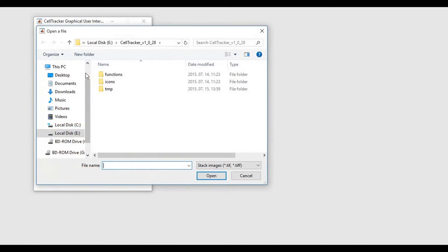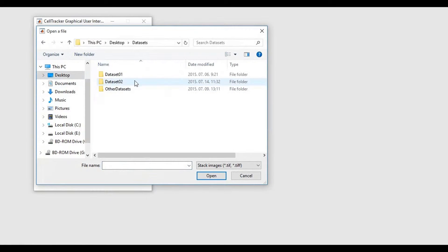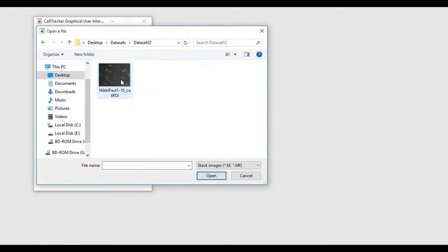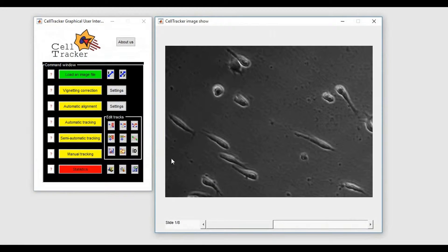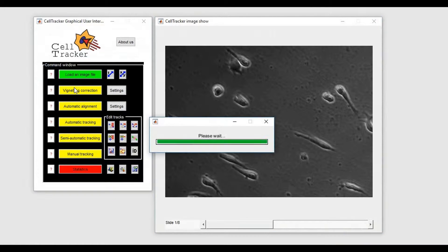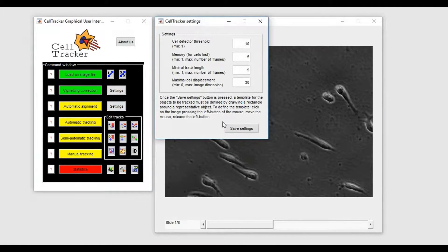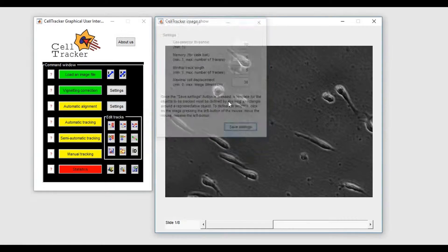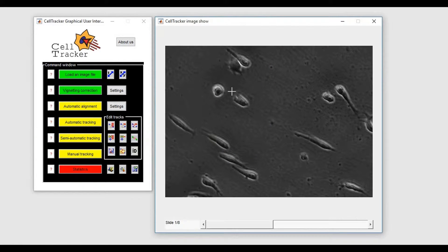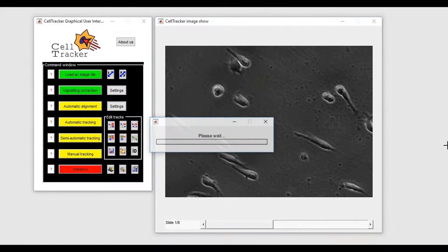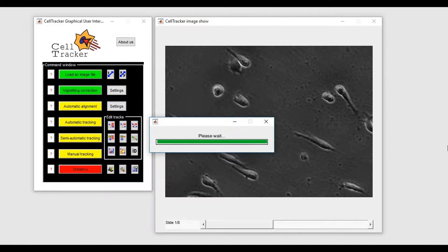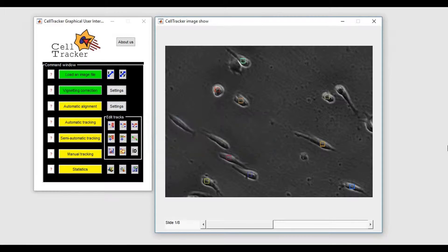Let us load a set of images and compute some tracks using the automatic tracking modality. A few attempts are required to find a good value for the CellDetectorThreshold parameter.